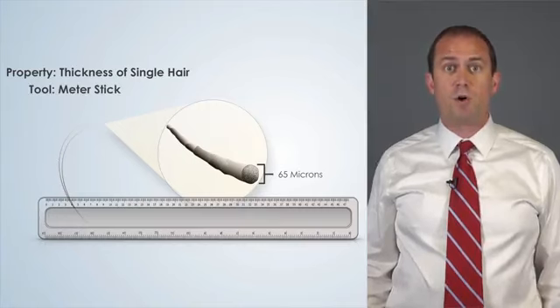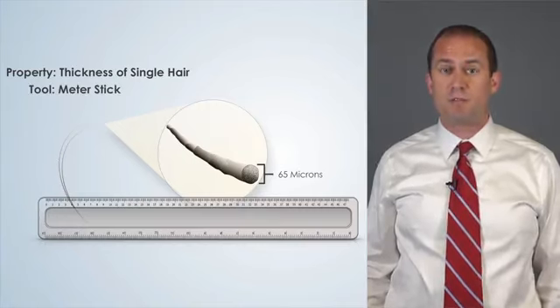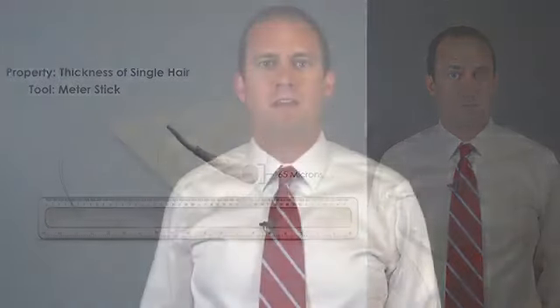The subdivisions only go down to millimeters, about 10 times the thickness of your hair. 1 million nanometers are in a single millimeter, or the smallest subdivision on our ruler. This is the scale we are measuring at with nanomeasurement tools. Visualizing and characterizing a specimen at the nanoscale presents significant challenges and requires highly specialized tools and equipment and highly knowledgeable operators to use them.